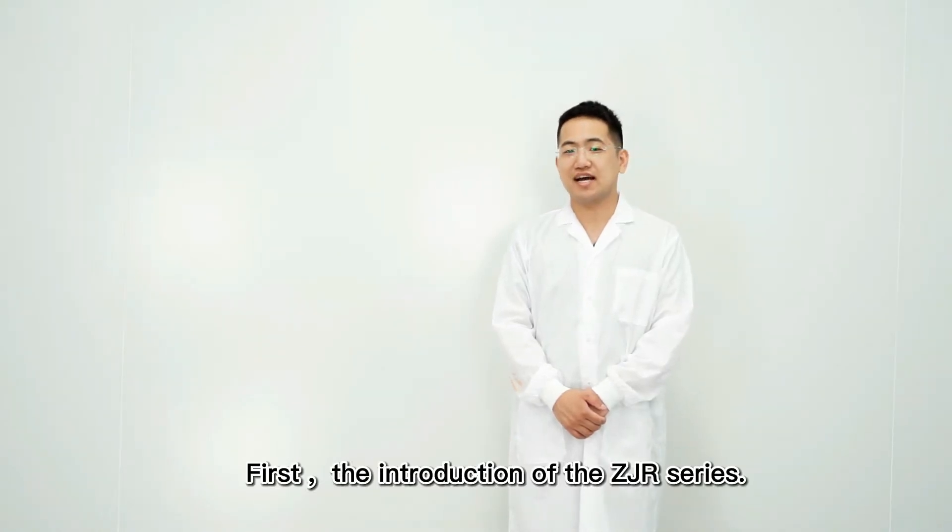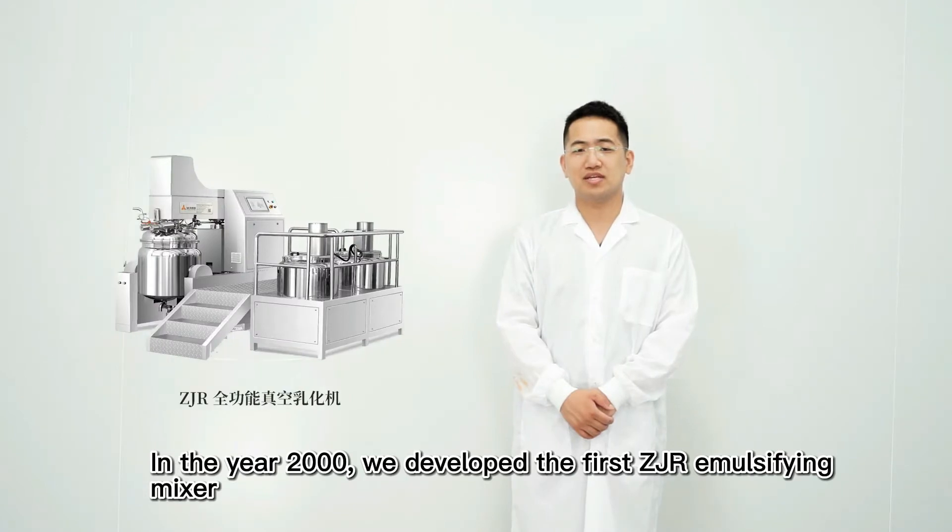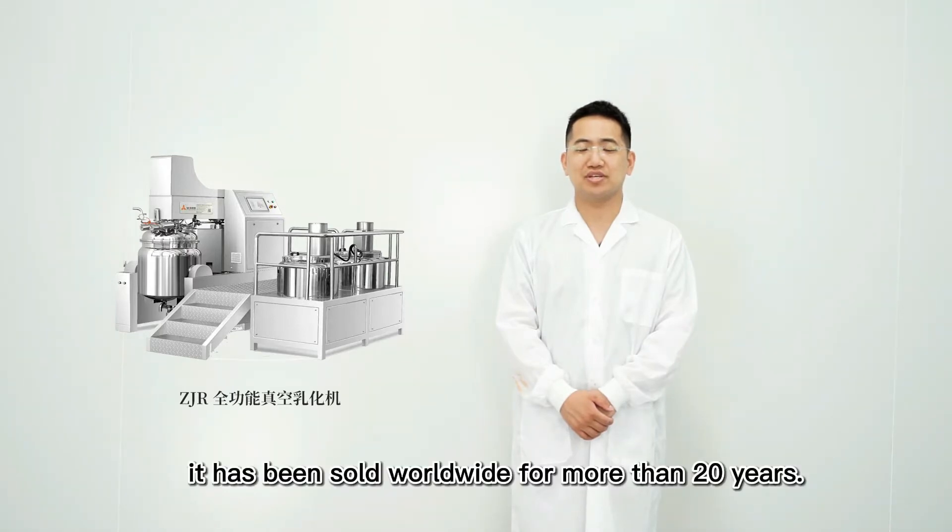First, the introduction of the ZJR series. In the year 2000, we developed the first ZJR emulsifying mixer. Since its successful development, it has been sold worldwide for more than 20 years.